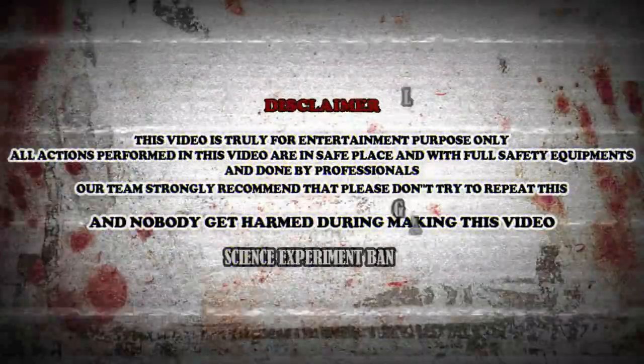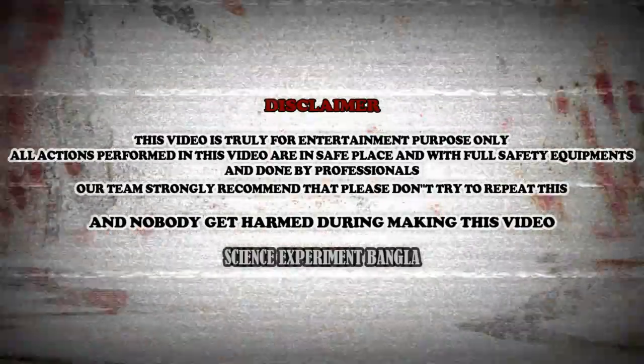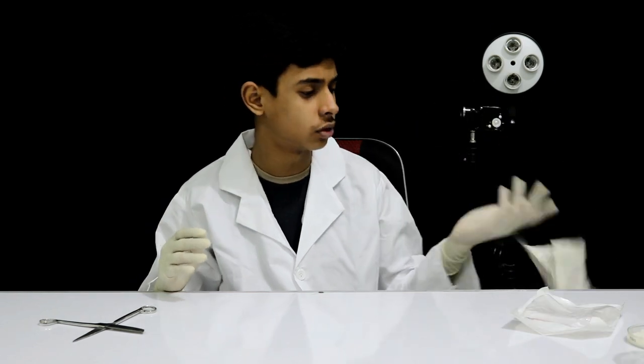I hope you will learn from this experiment. See this video. The gloves are all over here, and the equipment is very good for you.